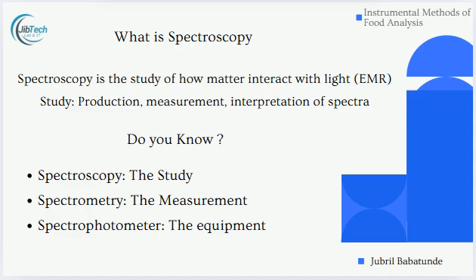And so basically that's what we do in spectroscopy. We study the interaction. Now you have shone light on the juice in the cup. The light has interacted with the juice, and some other part of the light goes off the cup. So what you're doing is studying the interaction: what amount of light goes into the cup, what amount of light goes out.